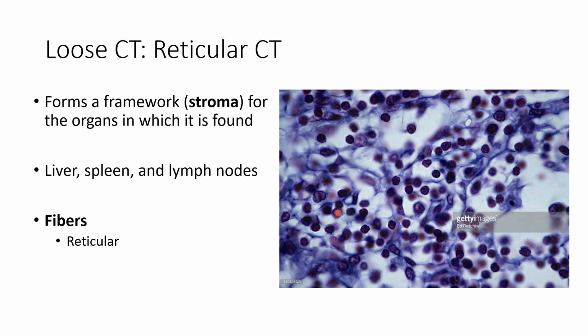When you see these sort of very circular round cells and these sort of darker staining, almost like a fractured glass background, these are the reticular fibers. So this is one that I could ask you what fibers you see because there's really only one. So when you see this sort of broken glass appearance with pinkish cells sometimes, that's going to be reticular.